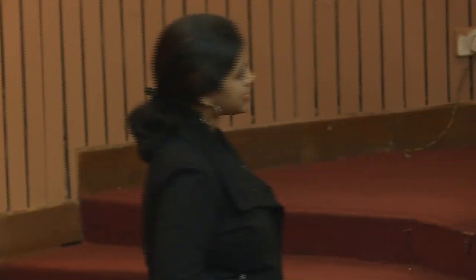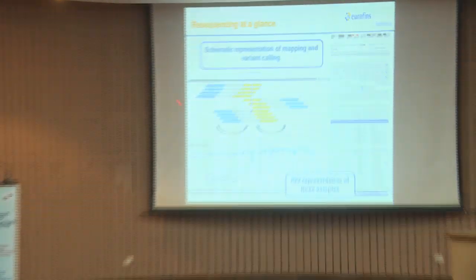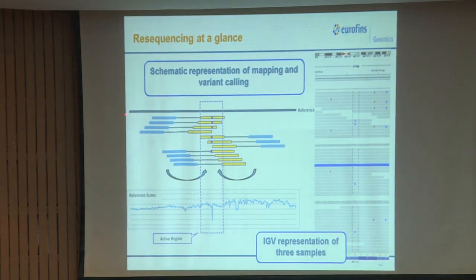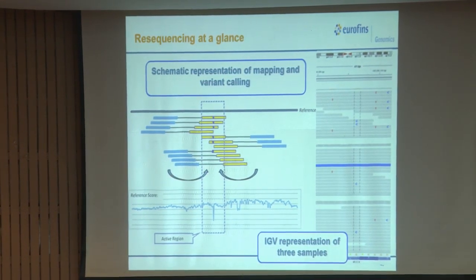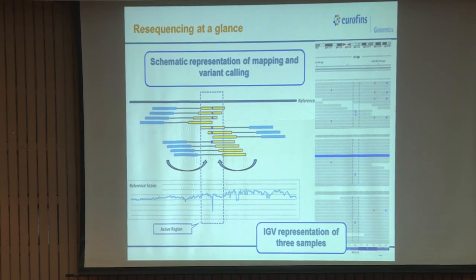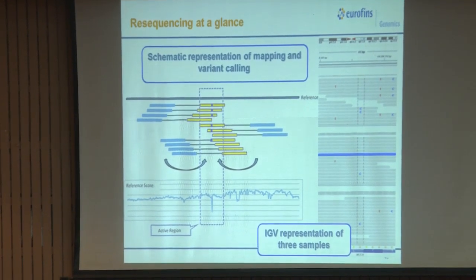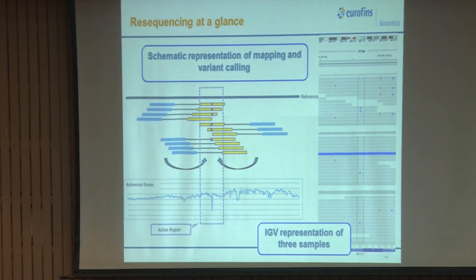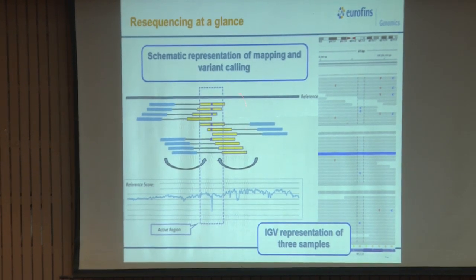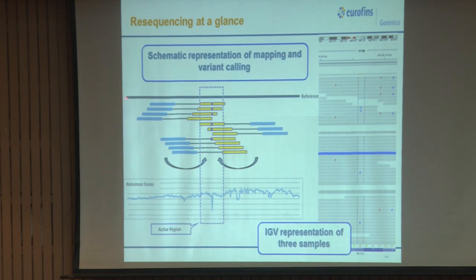So, we identify SNPs based on the differences in the sequences. Once we map the reads, what we identify is, from this end to this end of my reference, how much percentage I am covering, that is my genome coverage. Earlier we were seeing how much is my genome assembly, how much is the percentage of genome content in it, ATGC, that is my size of the genome. In this we will see, if my size of genome is 50 MB, how much I am going to cover after mapping.